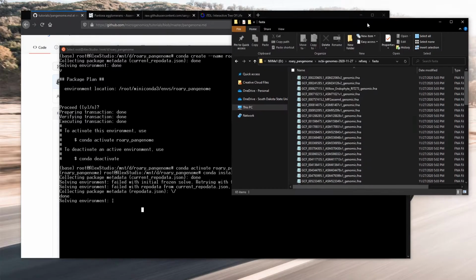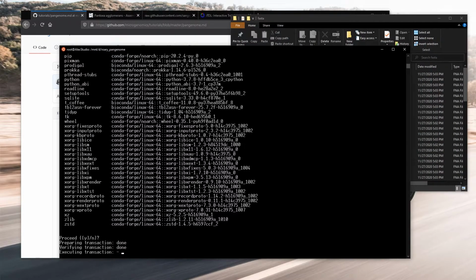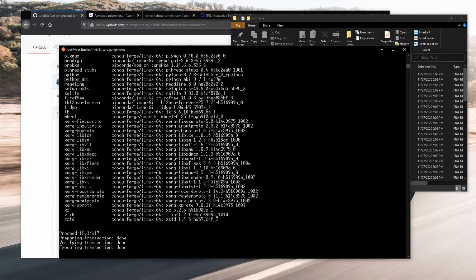But we'll skip over that. Okay, the installation of Prokka is done.